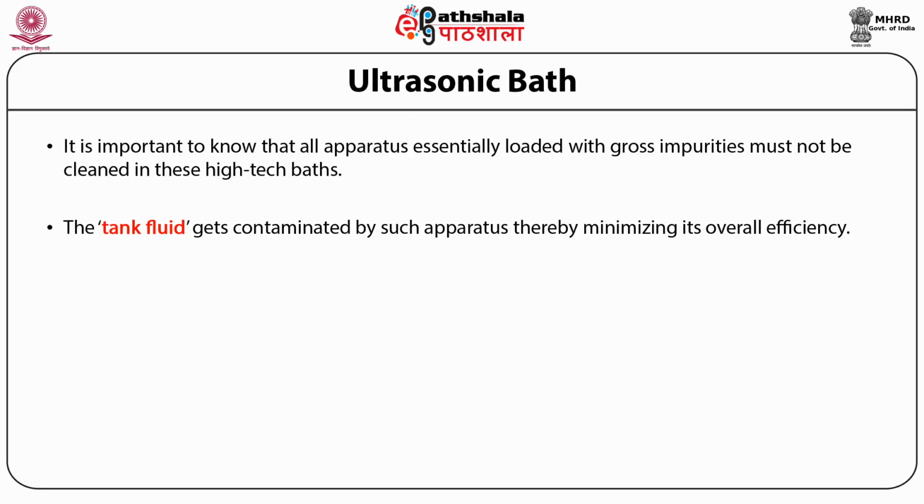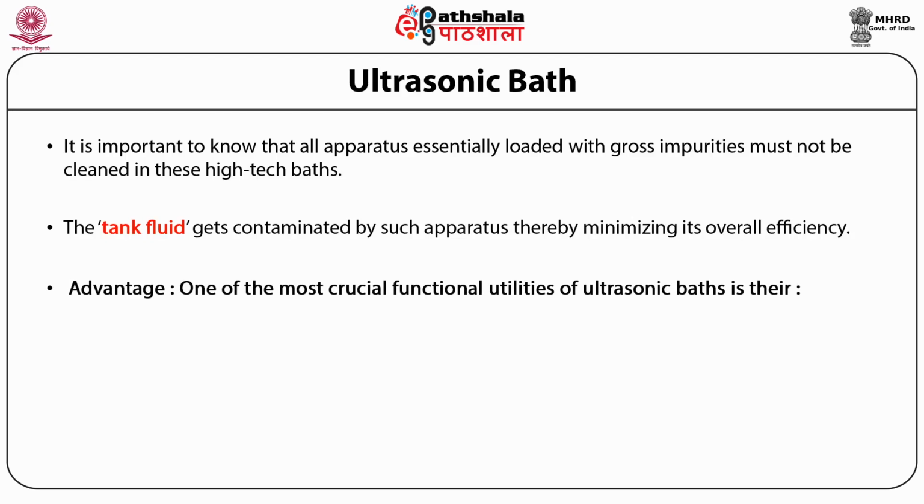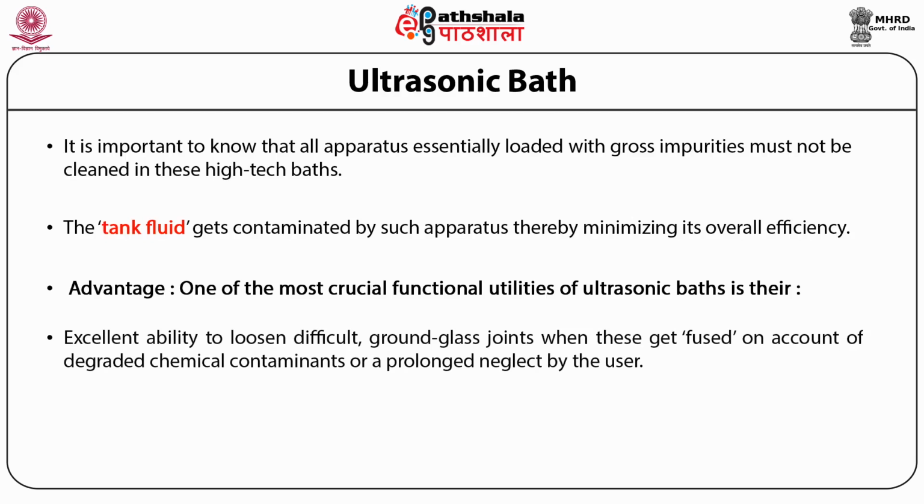One of the major and most crucial functional utilities of the ultrasonic bath is its excellent and remarkable ability to loosen difficult and rather stubborn ground glass joints when they get fused on account of degraded chemical contaminants or a prolonged neglect by the user.